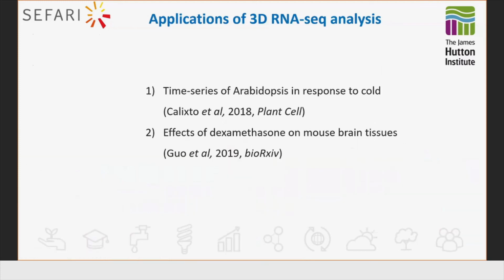Yes, we only have about 20 minutes left, so I'm going to show you two applications of the 3D app very quickly. The first one is for the time series of Arabidopsis in response to cold. The second one is the effects of dexamethasone on mouse brain tissue.